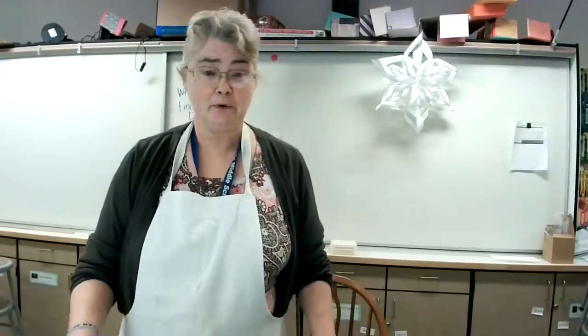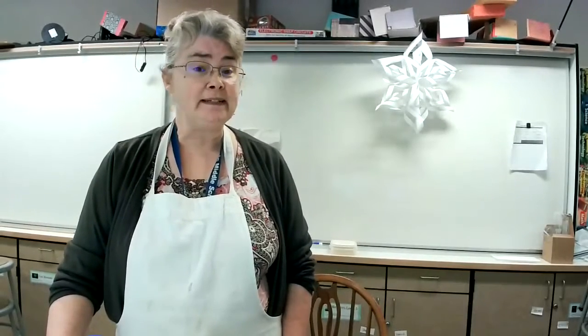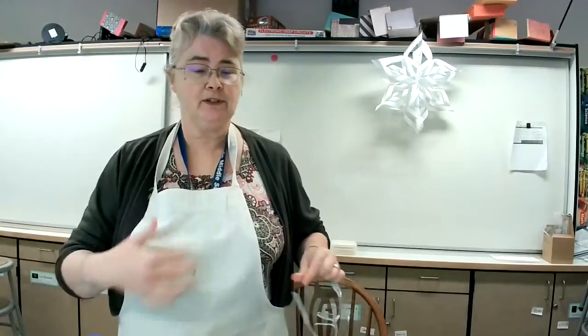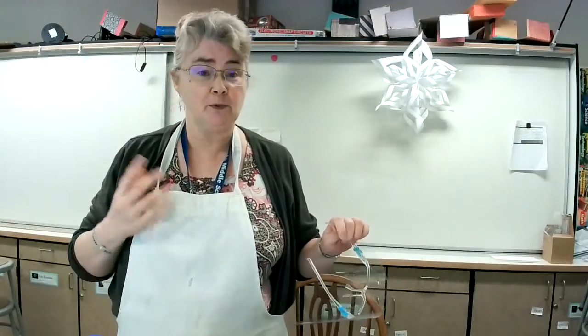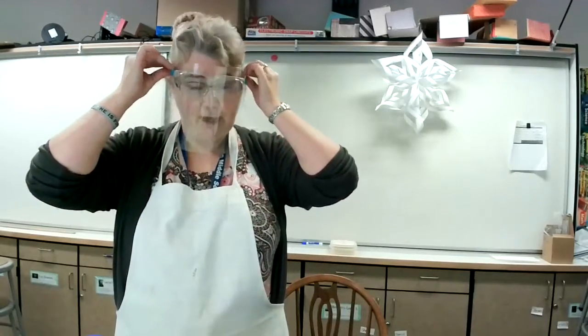Okay, this is Mrs. Kuiper, and this is the lab for lesson 4.8 solutions. You can see I've put on my protective apron here so I don't spill, and I'm going to put on my splash shield here. Usually just a pair of goggles or something that's going to cover your eyes would be great. I could also wear a mask if I needed to, but I think I'm going to be okay.